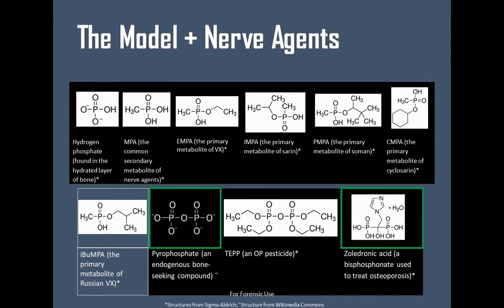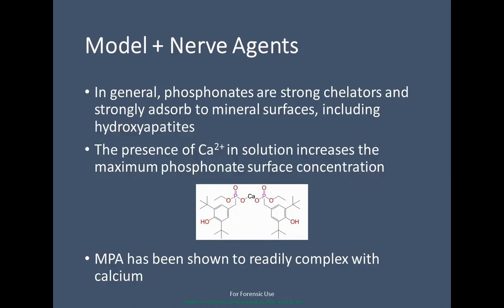also could be bone-seeking. And so these are just a select few of other potential species that are present that we either might take for a clinical reason, as in osteoporosis, or that might be present in other regions for us to understand what happens to the bone and how we can analyze specific species present in the bone later on in life.